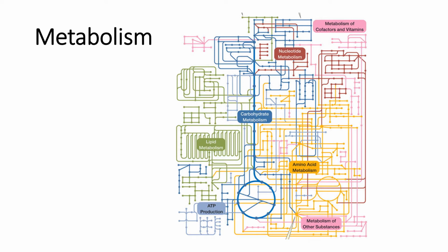So we're trying to identify the different types of enzymes that are present in a bacteria and then compare that profile to known profiles. Of course, we are unable to actually see if these enzymes are present, so instead we need to use indicators, some sort of indicator that this reaction is occurring.